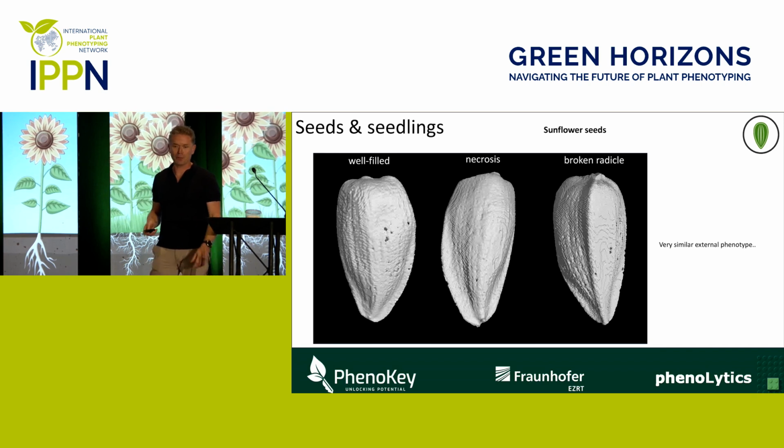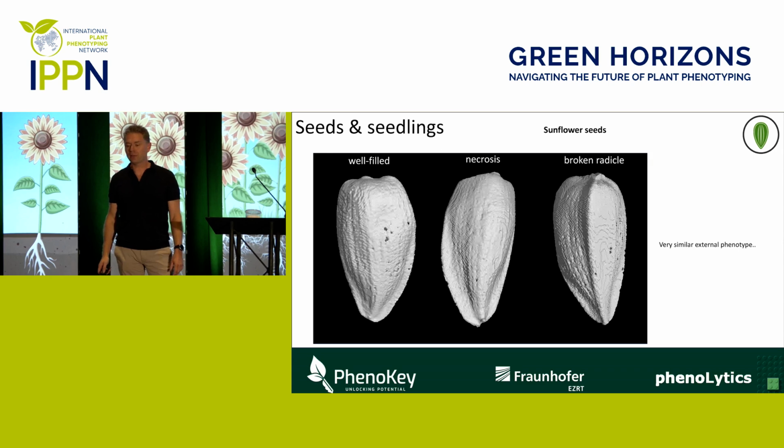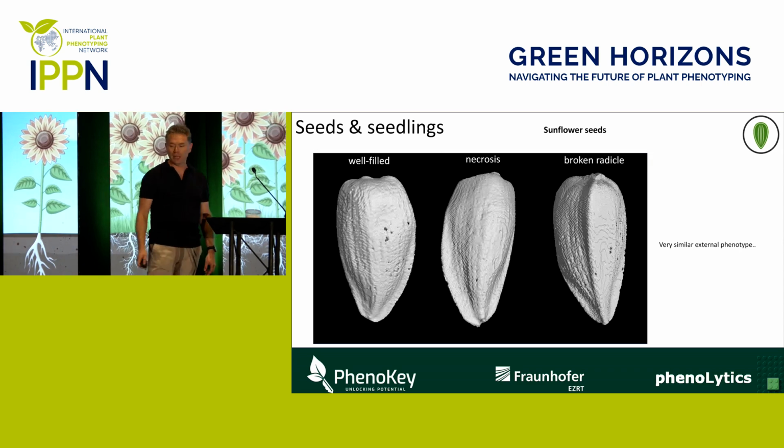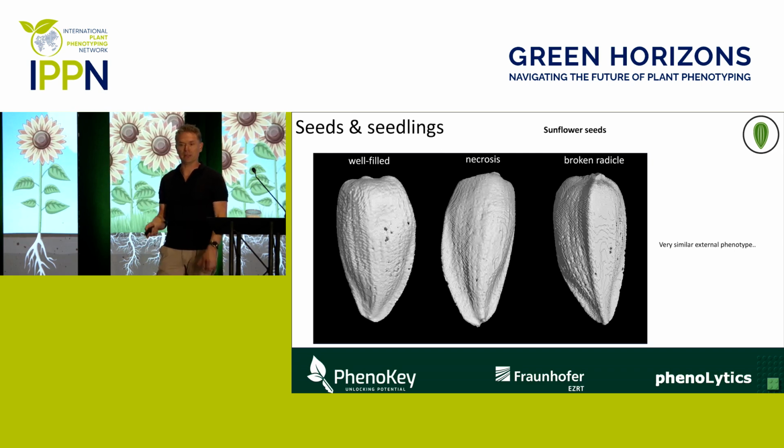On the left, you see a well-filled, healthy seed, which will probably germinate well. And the 2 images on the right have different types of problems, a necrosis or a broken radicle, which might or might not result in healthy and fully developing plants. And so that definitely shows the benefit of looking inside the seeds and not only at the outside.